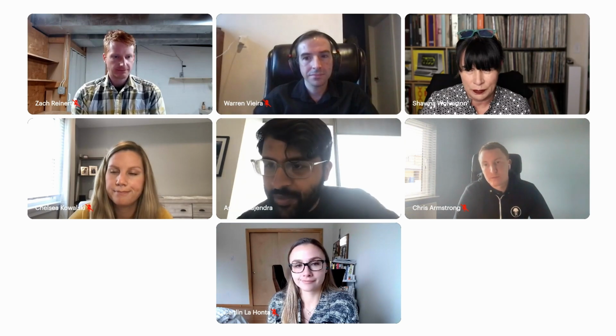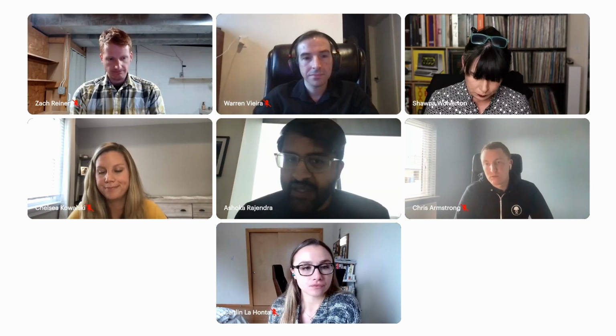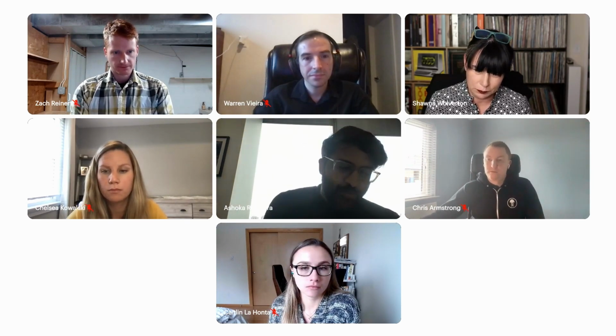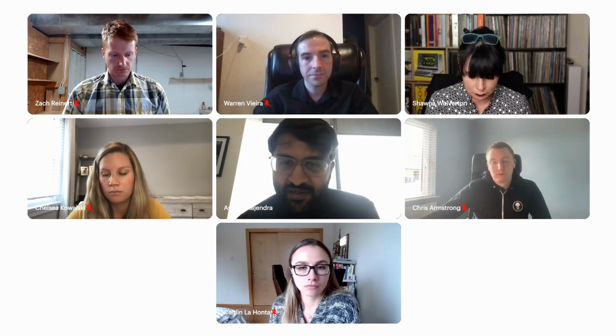Thanks, Ashoka. There were a couple other questions as well. I have it on, for those of you who already have workflows. So this is on today. I linked a help document that can show you how to access the functionality that Chelsea demoed. Many of you might have registry, inventory and notebook, but we see people graduate from the processes they might represent in a notebook into ones that can be structured across teams. So definitely reach out to your Benchling team, and we can talk to you all about how to get you set up with this functionality.